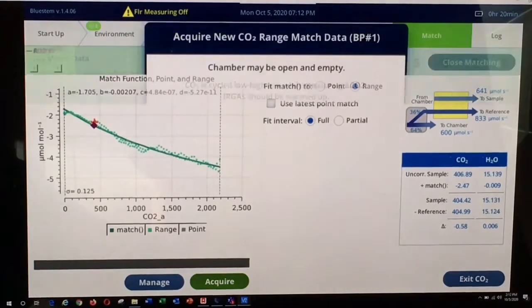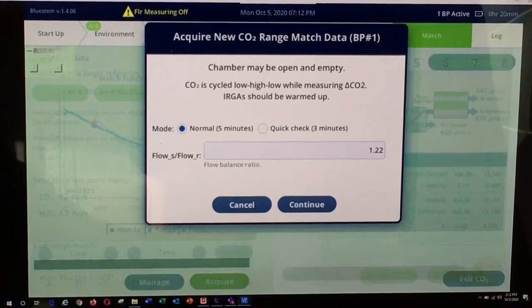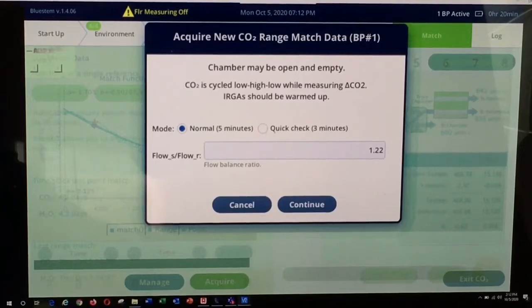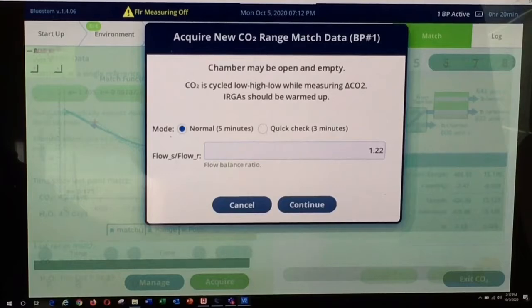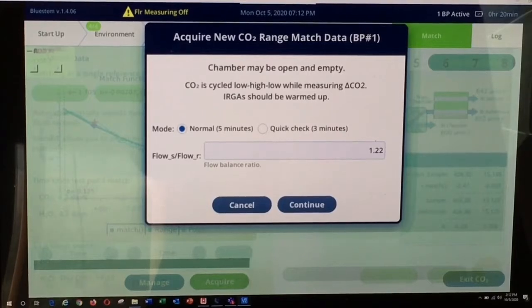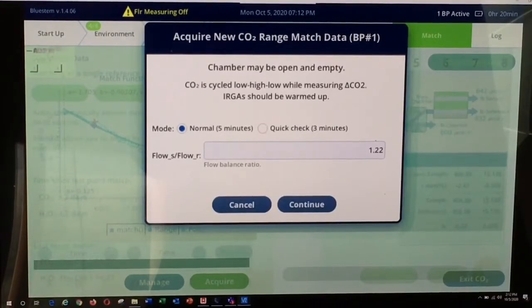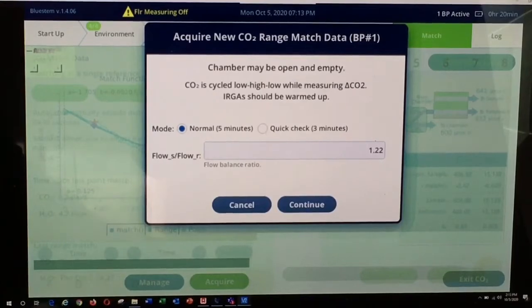I'm going to press that. You are presented with a couple of options. You can run a normal range match curve, which takes about 5 minutes, or a quick check at about 3 minutes. In most cases, I recommend the normal range match functionality, especially when you are starting up for the first time over the course of a day. The next box is the FlowS to FlowR flow ratio. This may be set to a different value by default on your instrument, usually around 1.10 or 1.13. You may need to occasionally adjust this value to get the best possible range match. To begin, simply hit the Continue button.